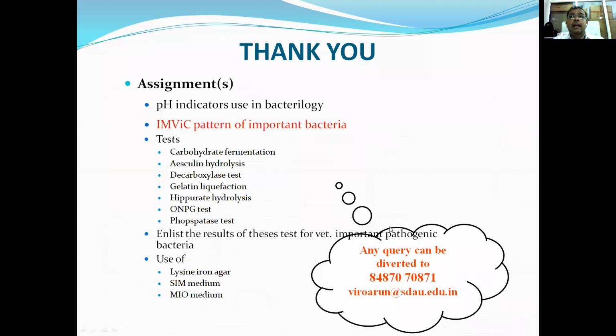So this is in brief about the important secondary biochemical test, and this is part of your assignment. I have listed two important things you have to remember from my side, along with all the listed assignments. You should prepare one list of pH indicators: what type of color they give in acidic pH and what type of color they give in alkaline condition.